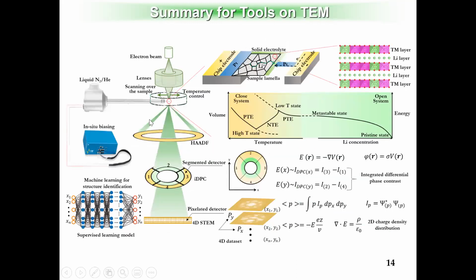Okay, so this is if I want to build a microscope, the dream version. Basically, you want all the fancy tools that I just described, but also you want this segmented detector. What you usually capture is the intensity difference, or the intensity contrast.